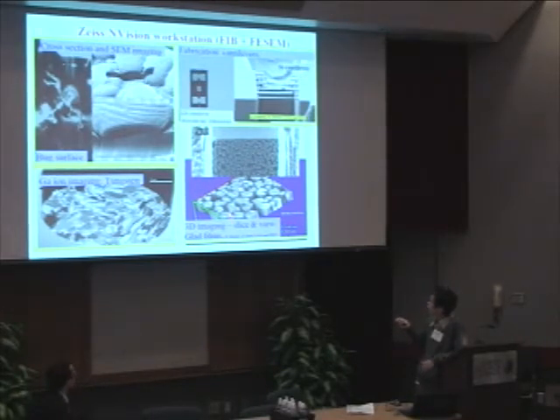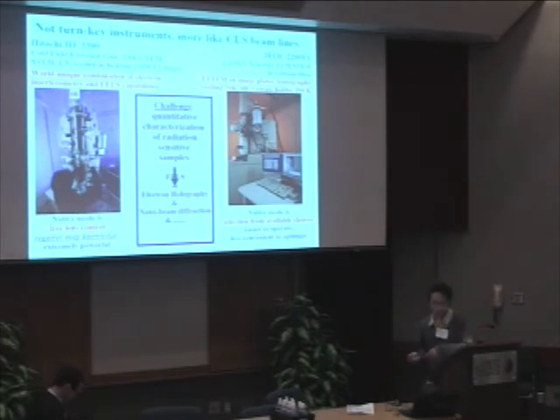Here is a reconstructed image of a glass film. Here you see the top view of some images, and here is the reconstructed result.